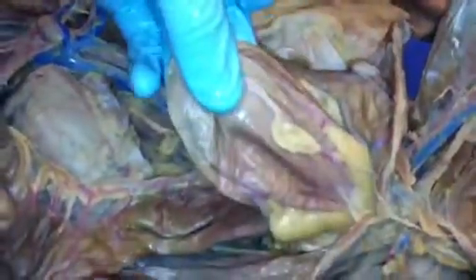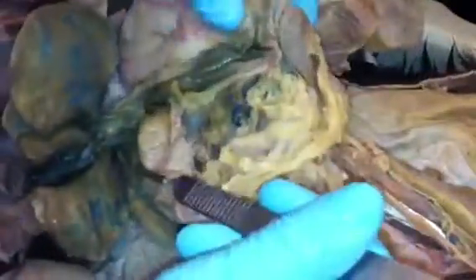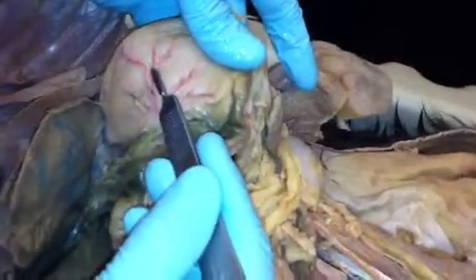That's it. And then the organs, this is the bladder, large intestine, small intestines, goes into the small intestines attached to the duodenum, into the stomach. Then we have the greater omentum, which is a fatty tissue that overlies all these small intestines.